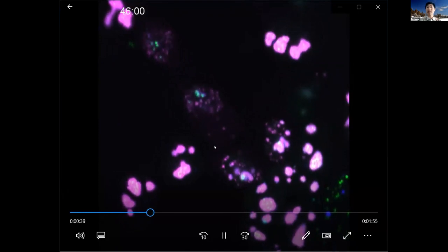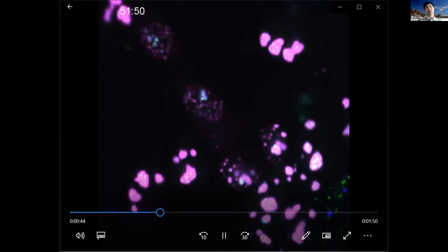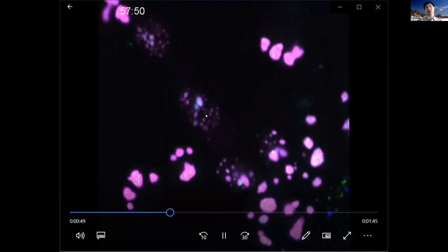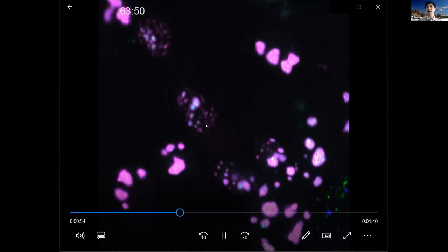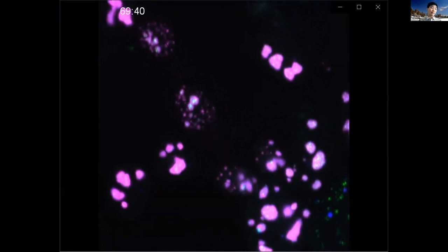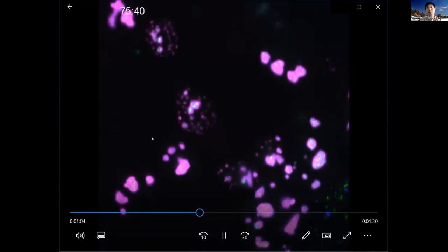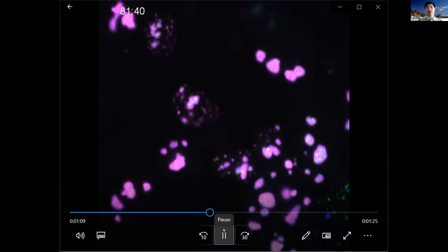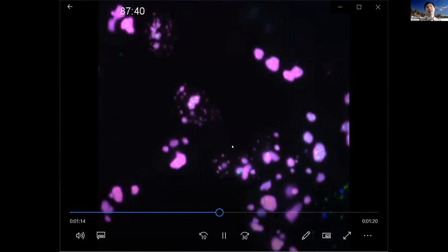So this is the phase condensation, but those clusters away from the core of the nucleus, the nucleoli cores start to grow, but other clusters start to evaporate and recondense on those cores. And to us this is a super cool movie because all three proteins that were tagged are endogenous tagged proteins, and we can literally measure their abundance, their concentration, and kinetics.